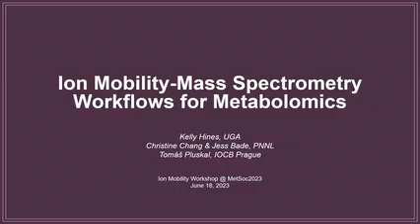What we're going to do today is discuss some different workflows and resources that are available for doing metabolomics with ion mobility mass spectrometry. So the order of the day: I'm going to give a brief introduction into ion mobility and talk about some resources that we're not going to have presentations on from the others. And then we're going to flip the order a little bit.